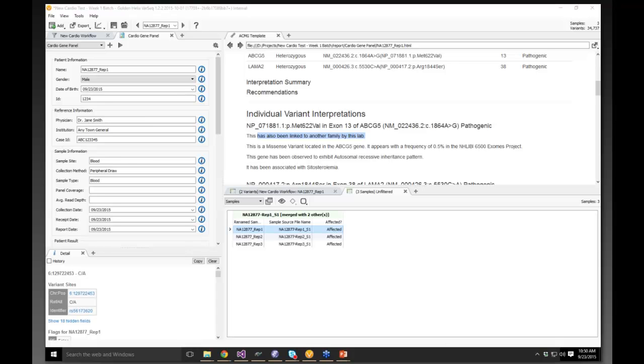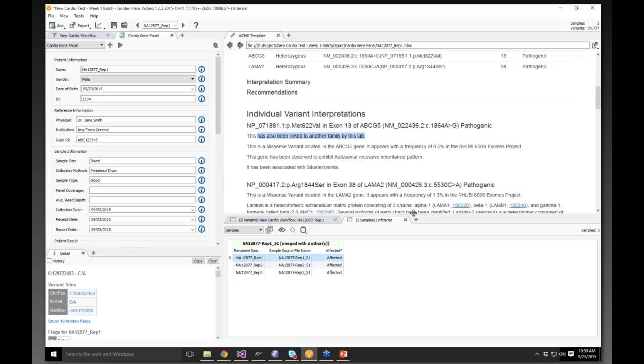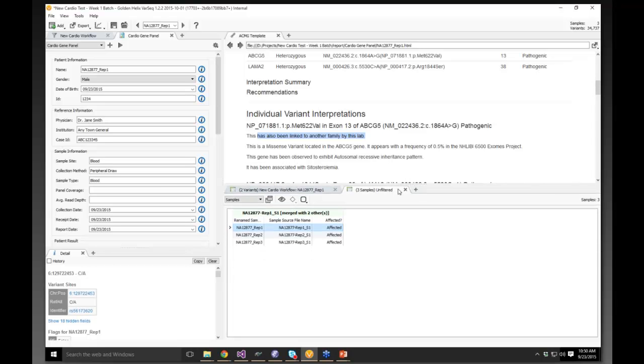Is VS Reports a separate license to VarSeq? Yes, VS Reports, like VS Pipeline, is its own standalone license. And again, if you are setting up a lab, we have bundles that will include things like 7 licenses of VarSeq plus Reports plus Pipeline, at a very highly valued discount rate, so that it makes a lot of sense to get you going and have all those components to really set up a lab properly to be efficient. If you have a smaller operation, you can get a standalone VarSeq license, and you can add Reports as necessary if you grow to the point of needing it.